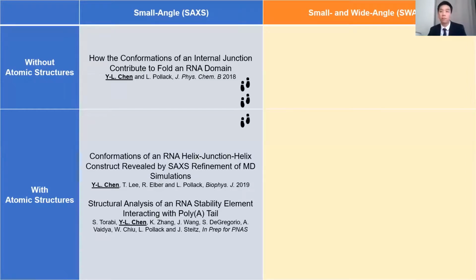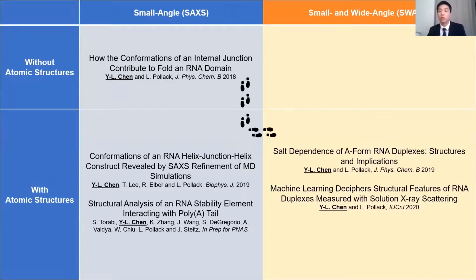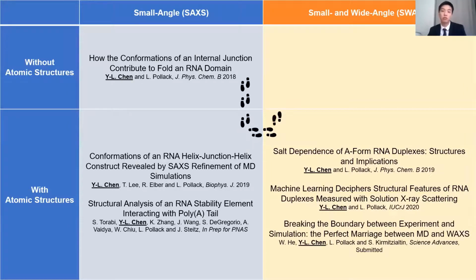We further push the boundary into an uncharted land, which is the wide-angle X-ray scattering. We need atomic structures for modeling and deciphering the WAXS profile using genetic algorithm or machine learning. And we further use WAXS to better MD simulations by sample and select strategy.